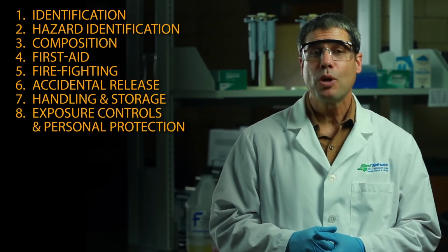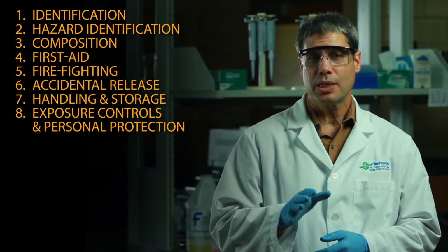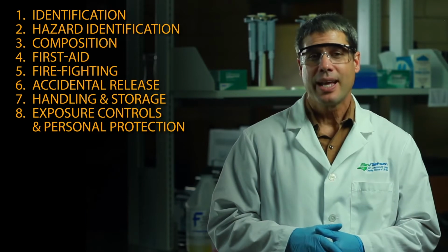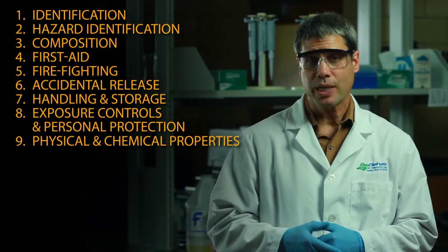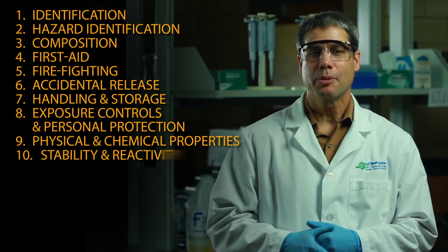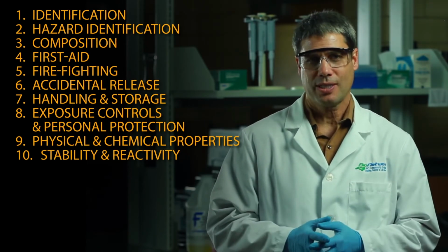Section 8, Exposure controls and personal protection. This describes OSHA's exposure limits and recommendations for PPE. Section 9, Physical and chemical properties, such as appearance, odor, pH, flash point, solubility, and evaporation rate. Section 10, Stability and reactivity, how to avoid hazardous reactions.